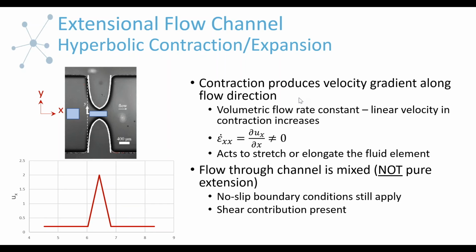So we're getting a question about when you have a real life application, I'm assuming, where the fluid is experiencing both extensional and shear flows. The question is, what is the relevant parameter when you're trying to predict the performance? And ideally, what you would want to do is try to set up an environment that's going to mimic reality, right? And try to impose both shear and extensional. So in this case, our hyperbolic contraction in our flow channel is going to apply both of these.